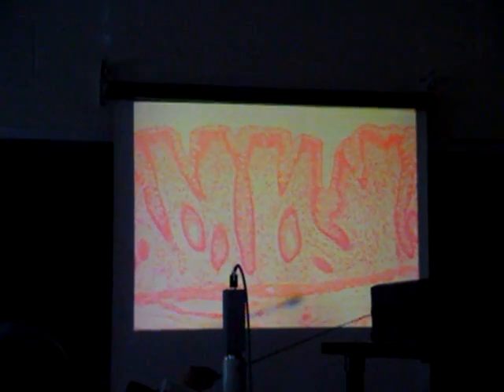Name the tissue here and the layer or sublayer. What is that? Smooth muscle tissue. What's that layer called, or sublayer? Muscularis mucosa, right there. And this is the submucosa. The power I'll test at is right here.